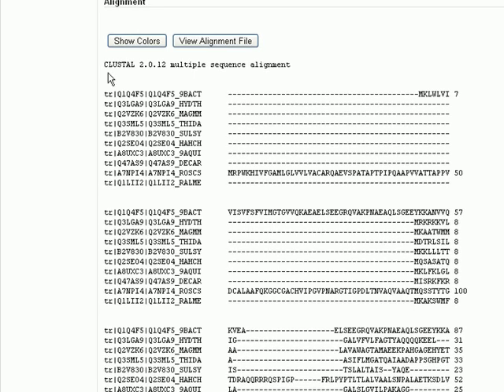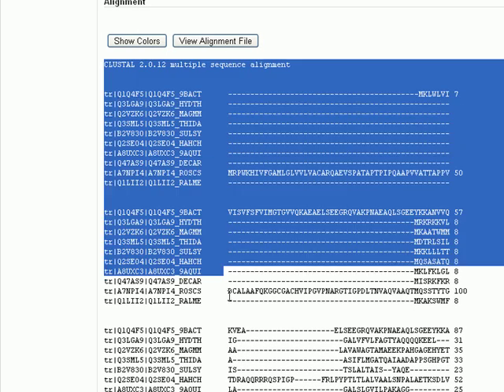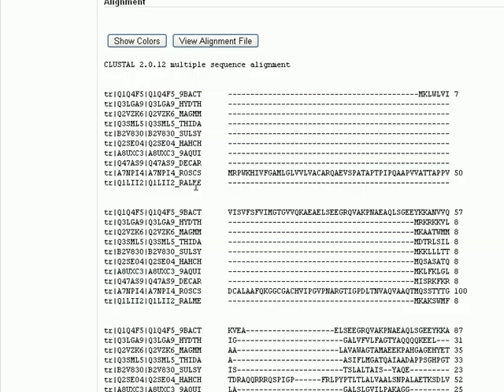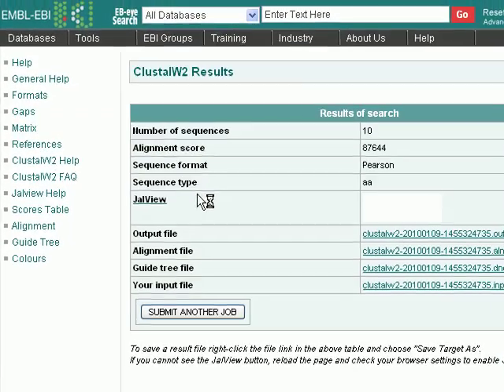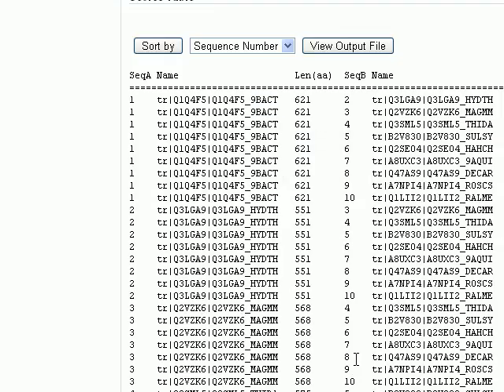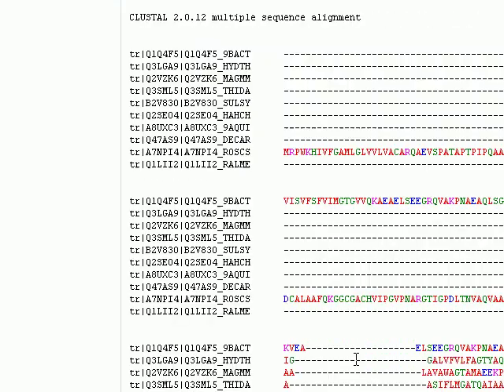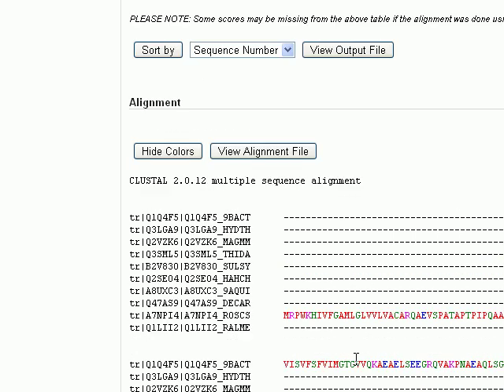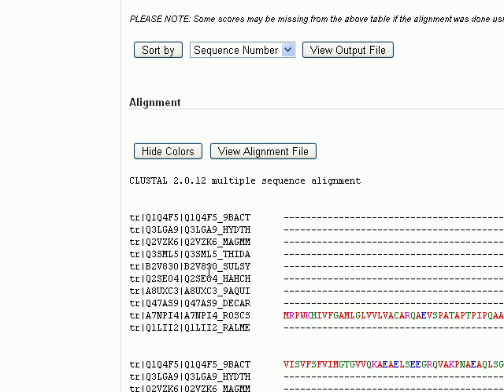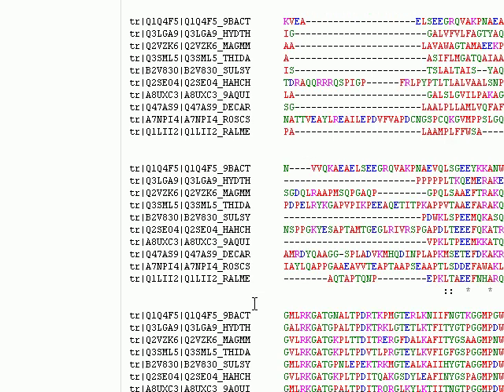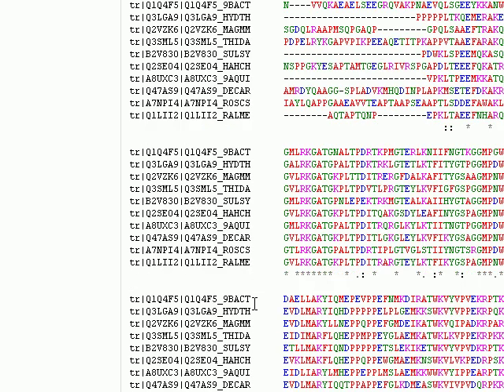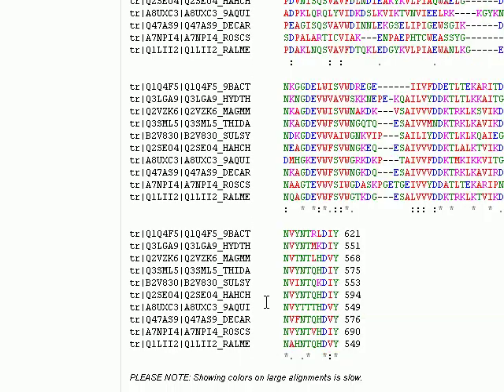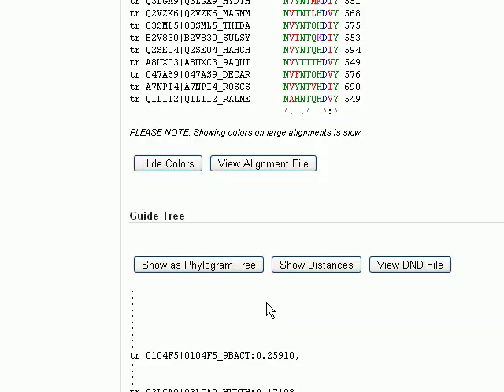This is our scores table and this is our alignment here. We can click on show colors to make the view more interactive. Okay, this is our multiple sequence alignment. We can copy it and paste it in our file to use it later to draw a phylogenetic trees, etc. Here is the guide tree.